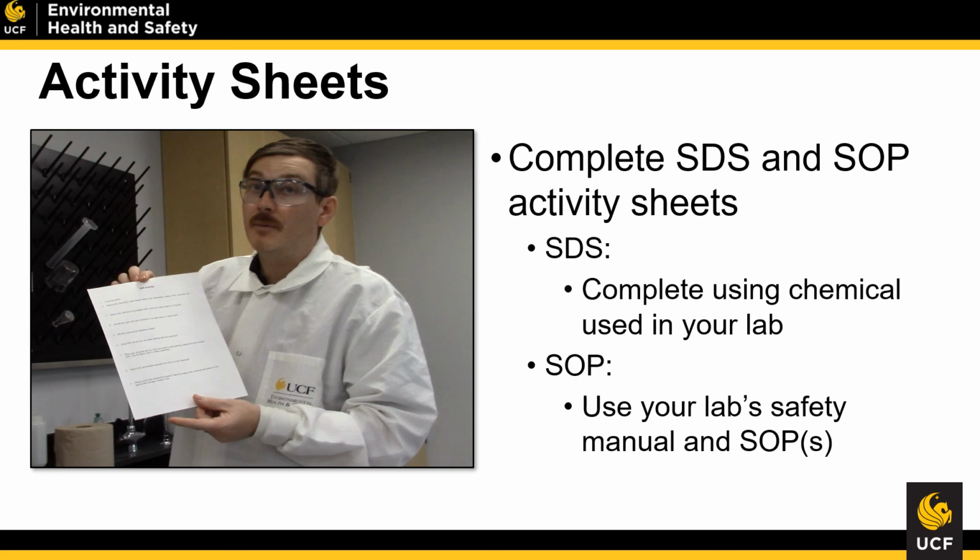The material within these two activities will cover all of the guided procedures that are covered under the UCF standard operating procedures list, which includes how to read an SDS, what are some of the working hours for the university, what is chemical storage, and what do we expect with your chemical inventory. Once you've completed these activities, please go ahead and check all your boxes under the UCF standard operating procedures. Also, we will provide you with some additional guidance, including a glove guide, so that you can compare gloves and their time linked to exposure for certain chemicals.